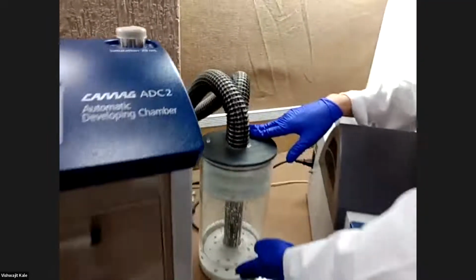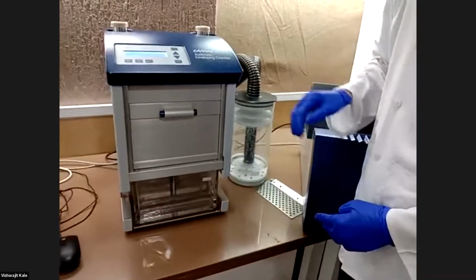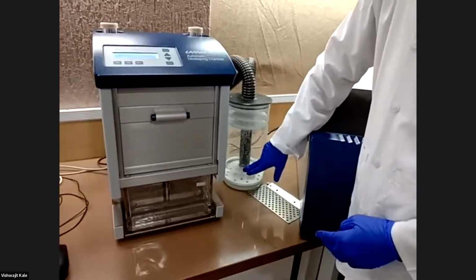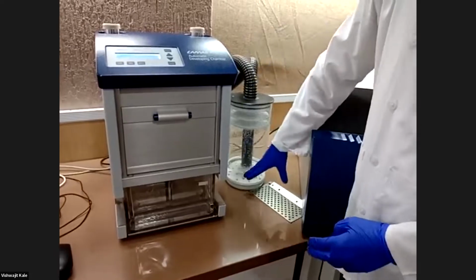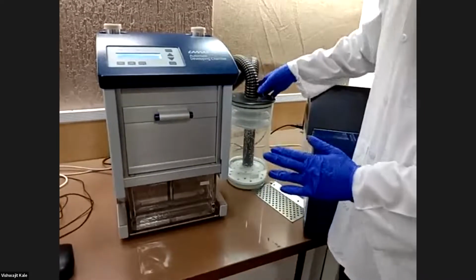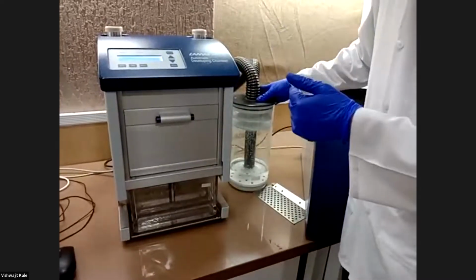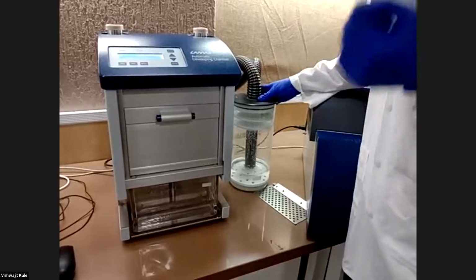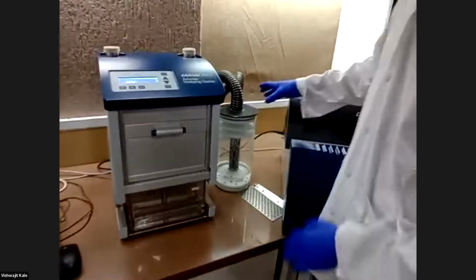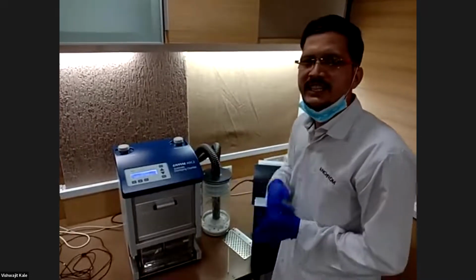This jar contains the saturated salt solution of MgCl2 hexahydrate or any potassium acetate, etc. Salt solutions we can fill, saturated solution we can fill in this jar, and this is required for humidity control of this chamber during chromatographic development. So we can maintain exact 33% humidity of this chamber during chromatographic development. That is requirement as per USP chapter 203 for botanical origin material analysis in HPTLC. So for controlling any other percentage of humidity, we can fill this jar with any other salt solution.